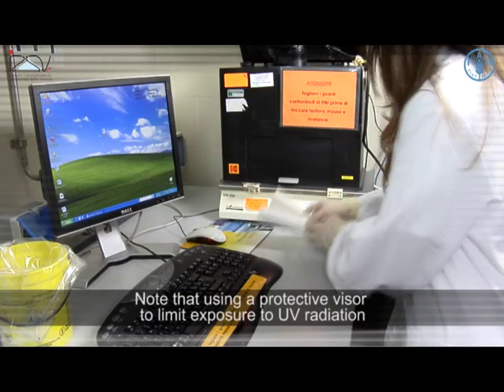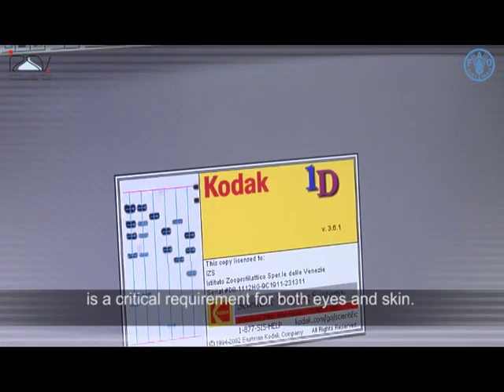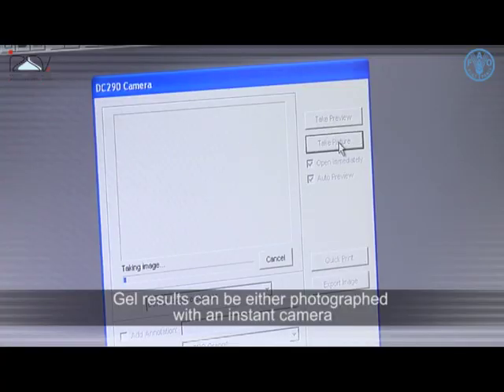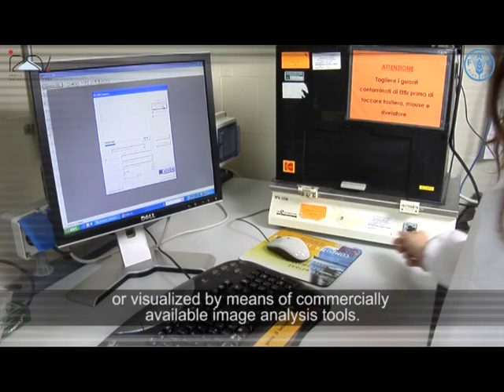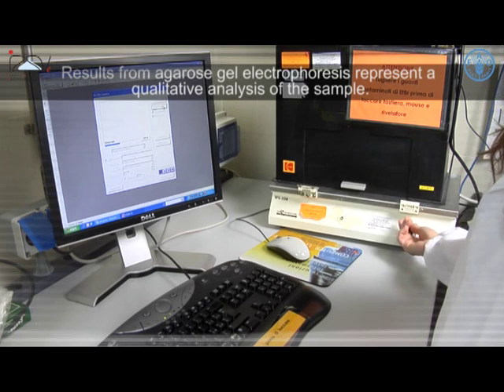Place the gel on an ultraviolet transilluminator or a UV light box to visualize the DNA bands. Note that using a protective visor to limit exposure to UV radiation is a critical requirement for both eyes and skin. Gel results can be either photographed with an instant camera or visualized by means of commercially available image analysis tools.